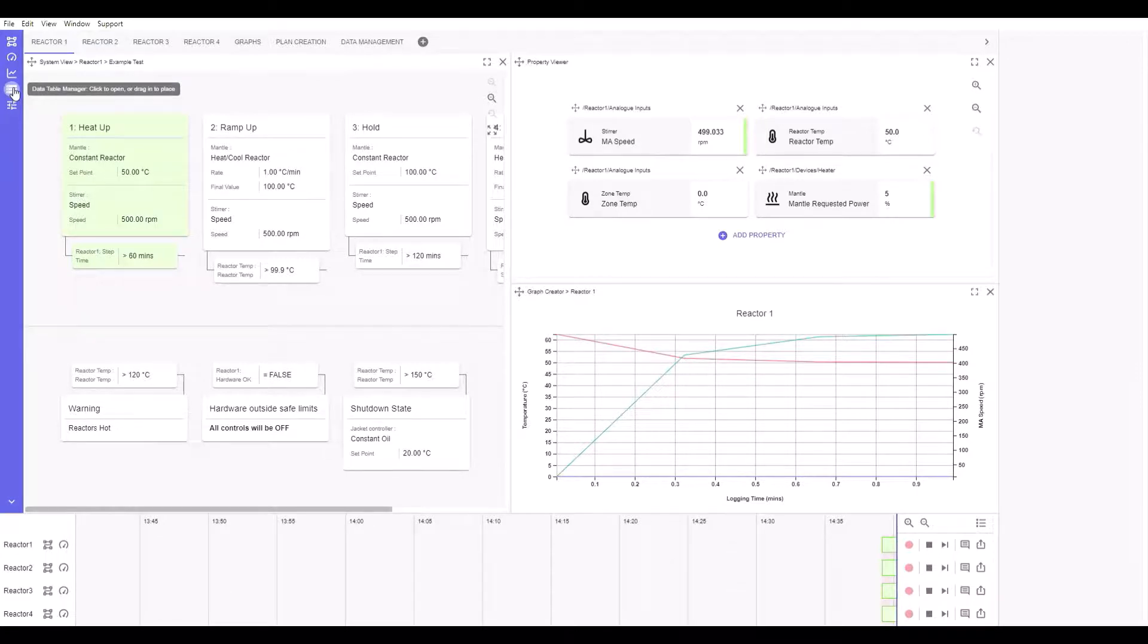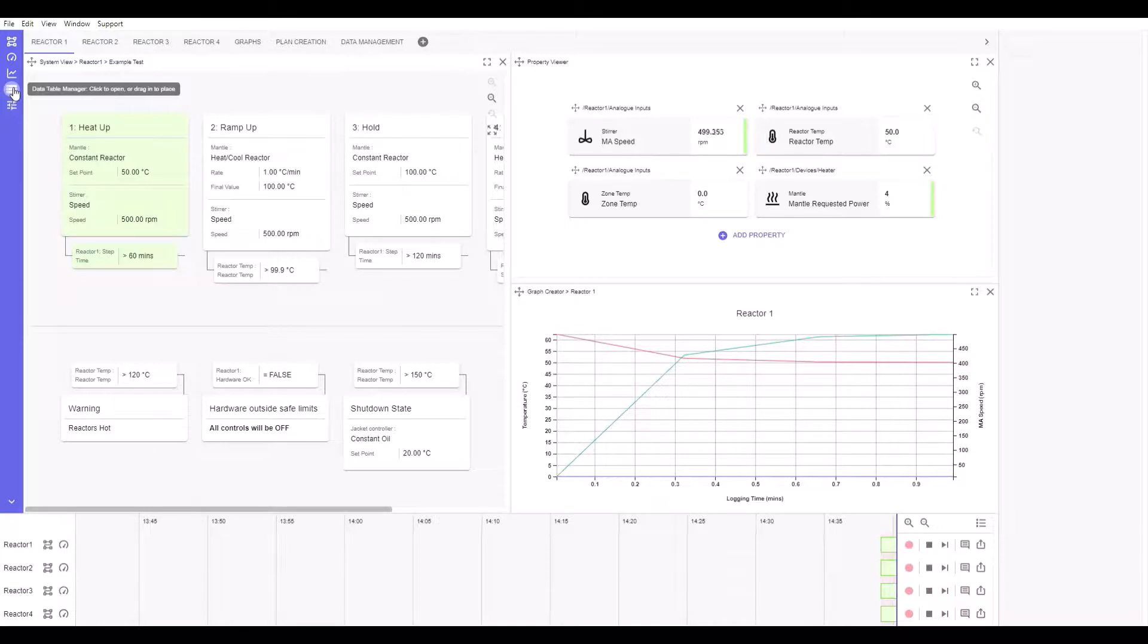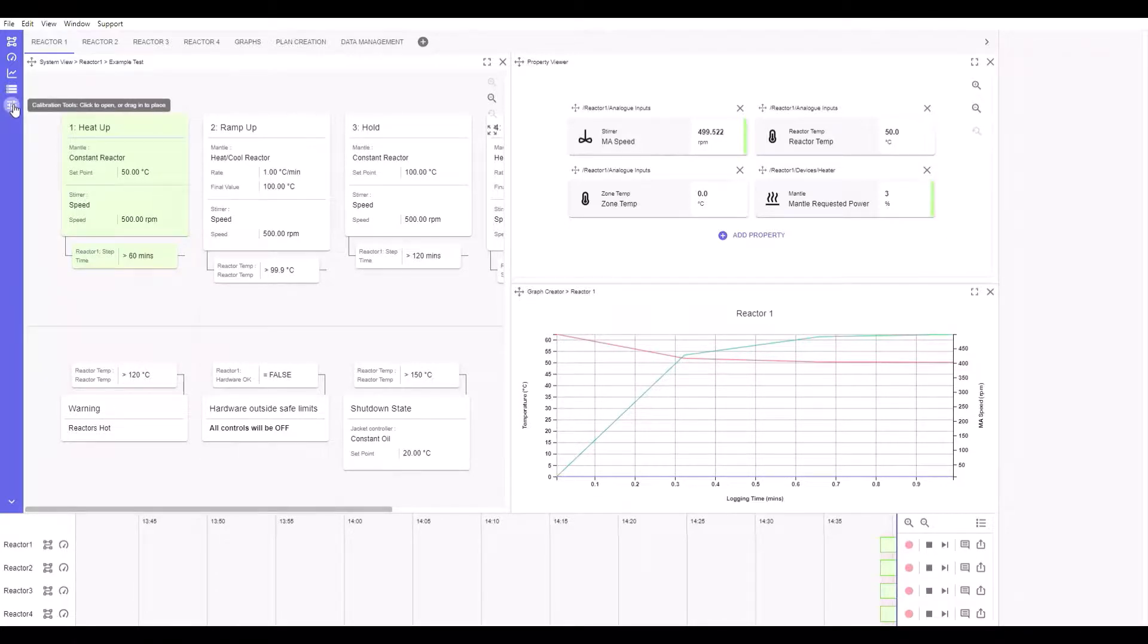from previous experiments; and finally, the Calibration Tools app, which contains various calibration tools to help regulate your HEL system.